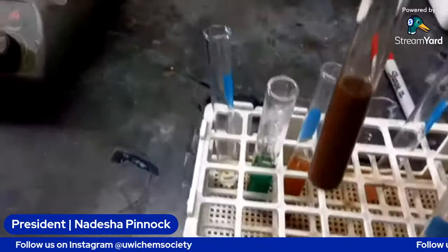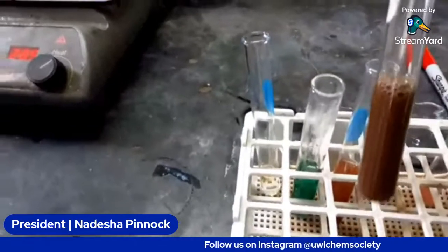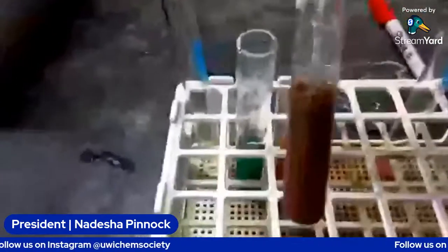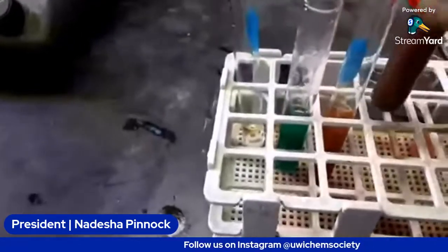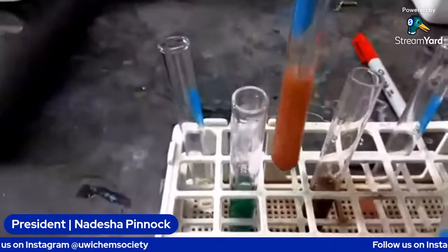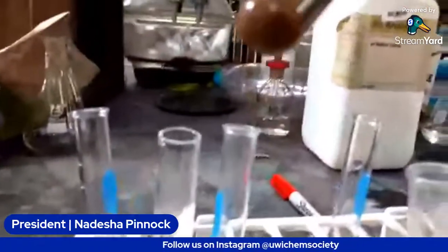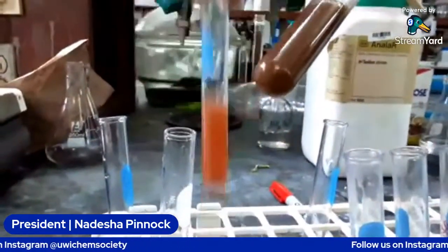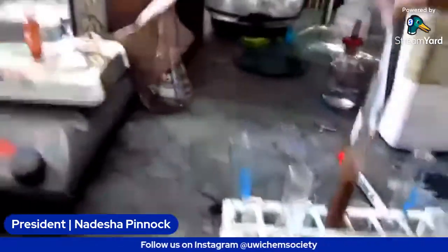This one is deep brown. Let me see. It's not quite red orange. It doesn't really look red. It's kind of like when you're going from yellow to orange, I guess, but you're not quite orange. So it's not as bright as this one, which is closer to red. And I'm not seeing a precipitate either. I don't see a precipitate in the bottom. So let's do the next one.